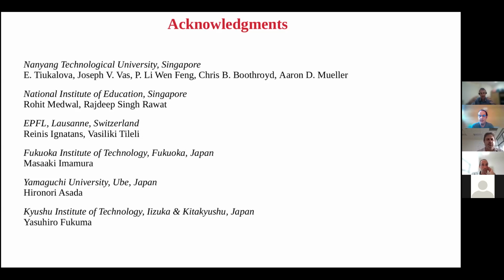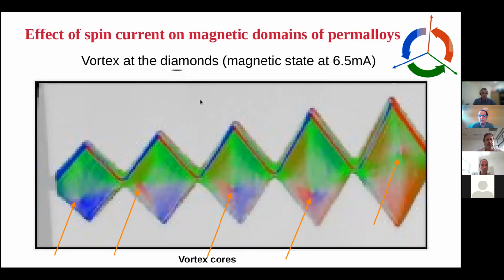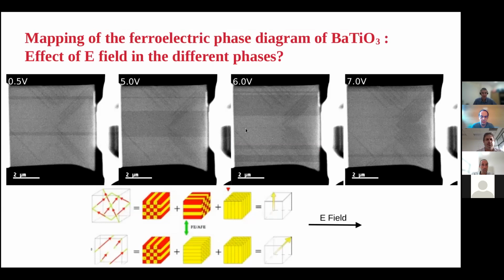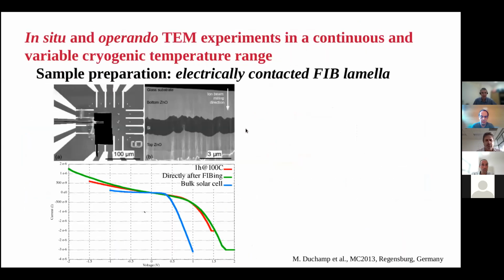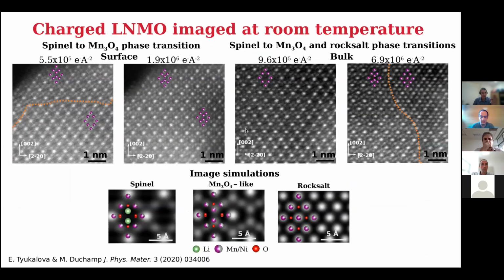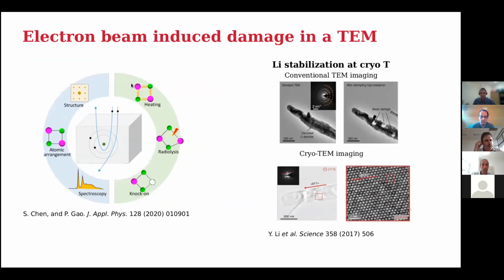That's one thing. And then we have different interaction mechanisms between the electron beam and the sample, so we have different degradation mechanisms. I just want to come back to this one maybe. There are some degradation mechanisms that have a kind of threshold; they need some threshold energy. Where are they? This one. So we have mainly three different degradation mechanisms. We can indeed change the temperature of the specimen, but that's not the one.